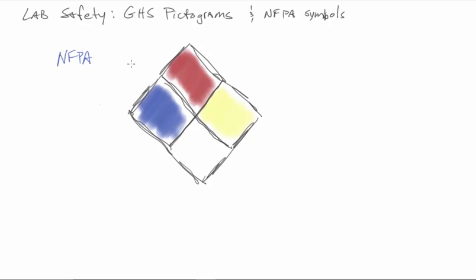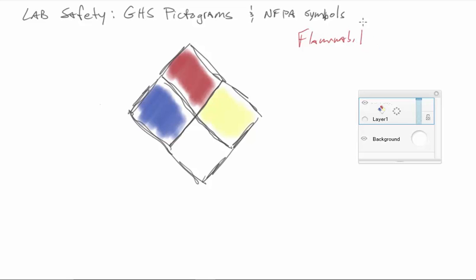All right, I shouldn't have put that there. I'm going to go ahead and erase that because I'm going to put some stuff over here. First, the red area I'm going to do over here. Red is all about flammability, right? So is this element or this chemical flammable? And it talks about the flammability hazard.